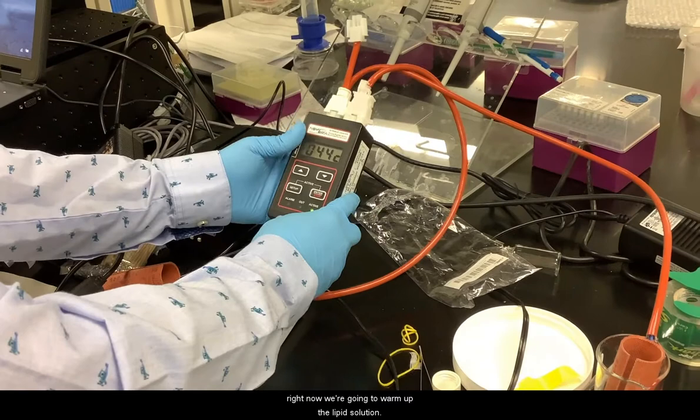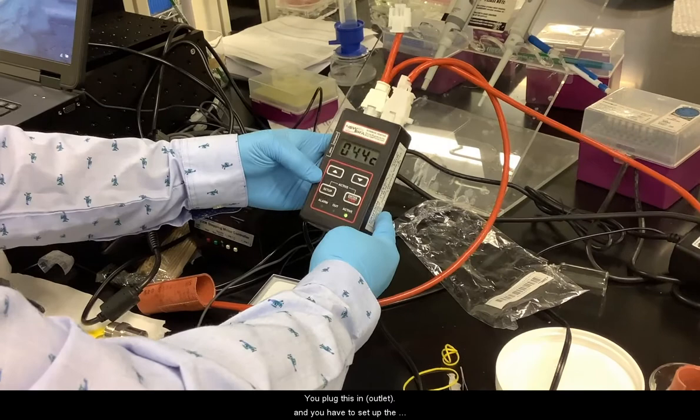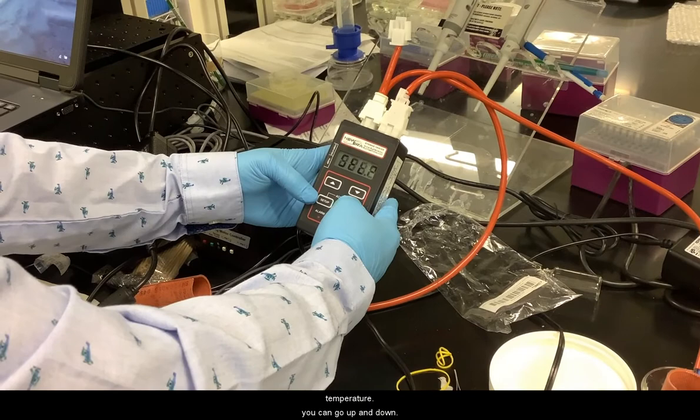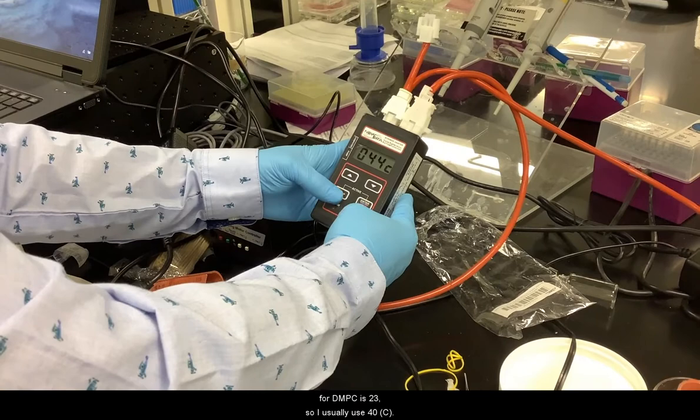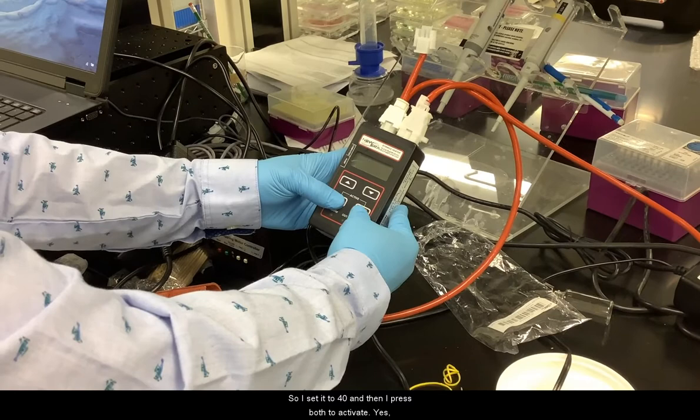To control this you plug it in and set it up. This is set temperature, and you can go up and down. The phase transition temperature for DMPC is 23, so I usually use 40. I set it to 40, and then press both to activate.